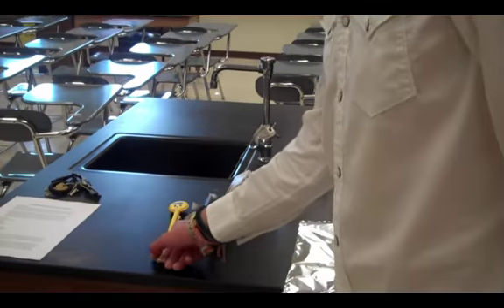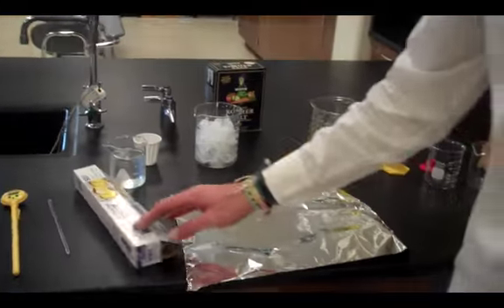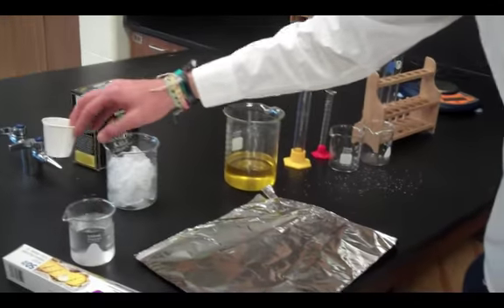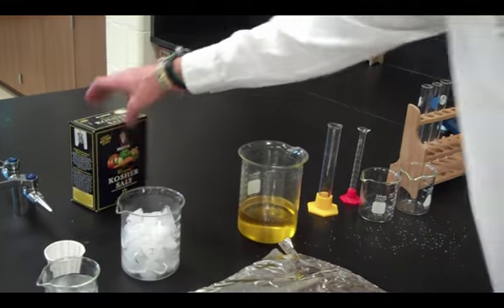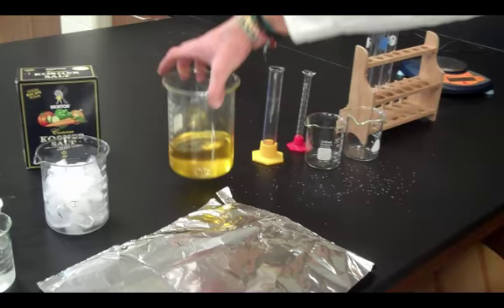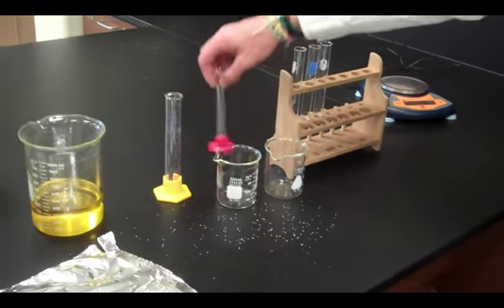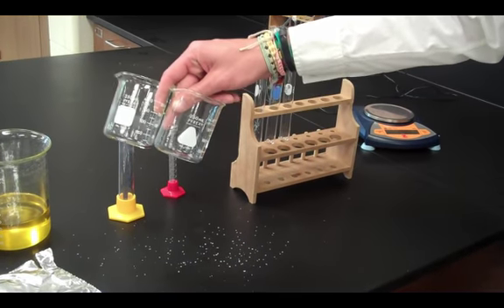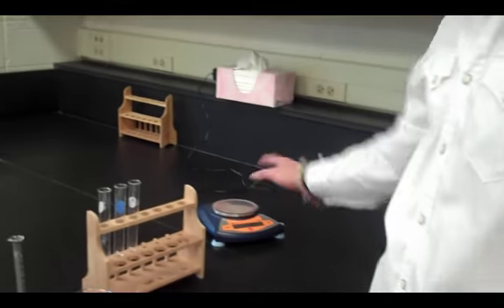So for our materials, we need a thermometer, a stirring rod, aluminum, some water, a Dixie cup for measuring, a 600 milliliter beaker, salt, some antifreeze, large graduated cylinder, small graduated cylinder, two 250 milliliter beakers, and 3 small test tubes, and of course our scale.